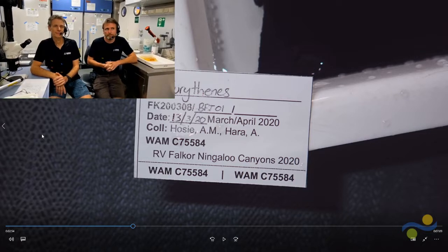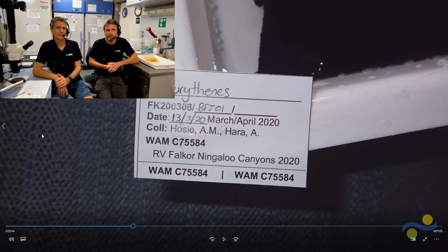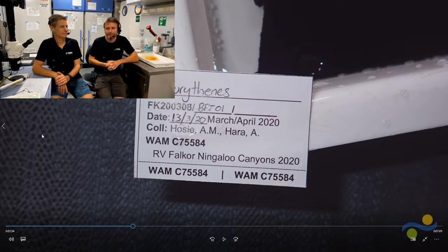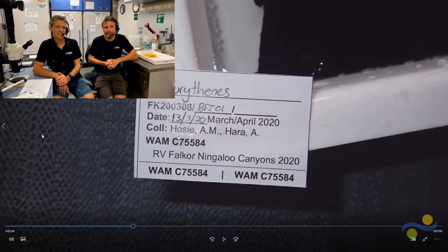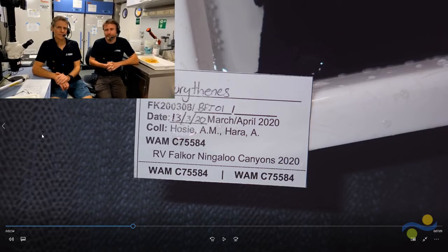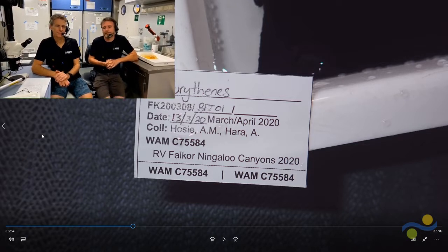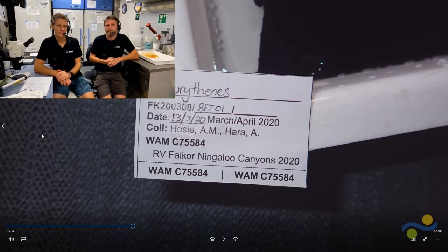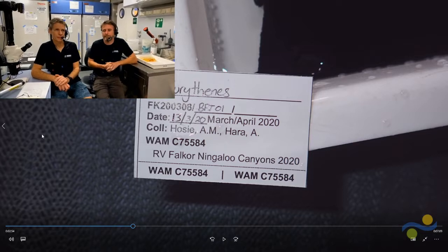Amazing. It's really interesting, all of the different species to see you bring up, and each one is taken such care of. They're all slightly different. Before we move to the next section, I'm going to ask, either of you can answer this. You mentioned formalin, or formaldehyde, sorry. What are the different types of chemicals that you use? And is there a reason why you're using formaldehyde versus some things that are fixed in ethanol, I think, and others? Can you talk a little bit about that sort of lab work?